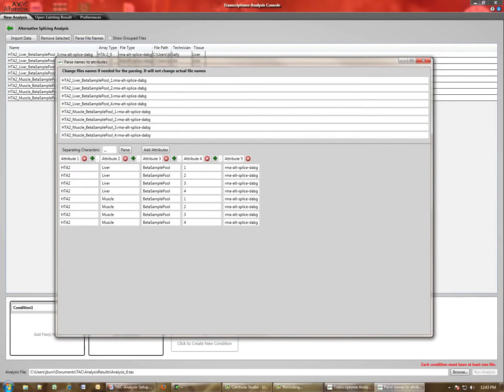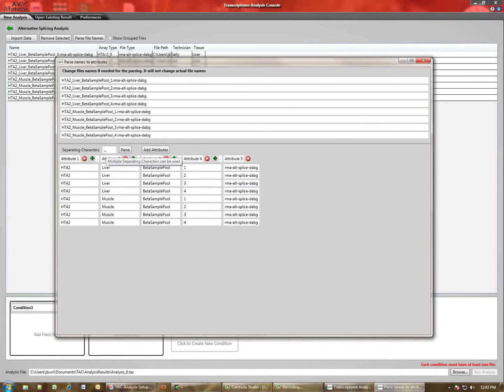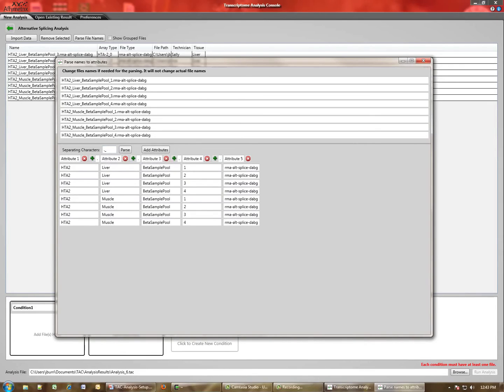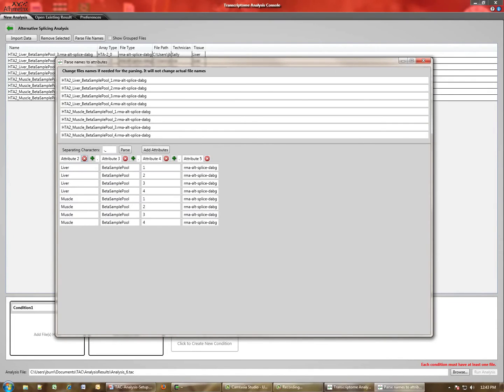So if we click that button, what comes up is you'll see that the various sample file names have basically been parsed out into five separate columns based on the characters that you've put in here. So we've selected both a space character and an underscore, which splits up the file names into the various attributes.